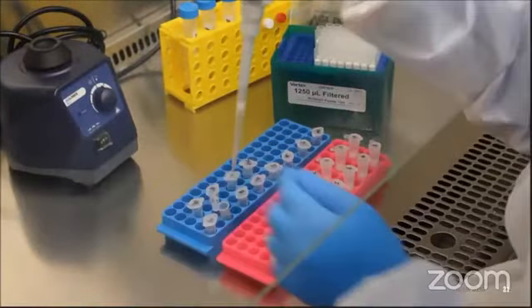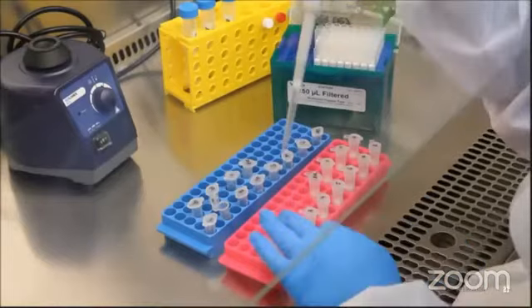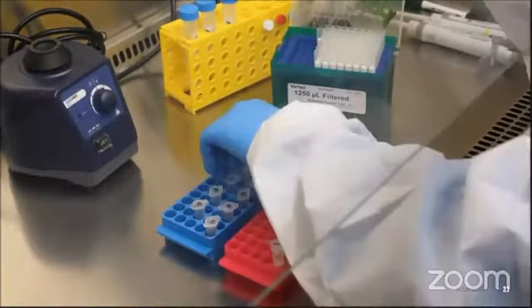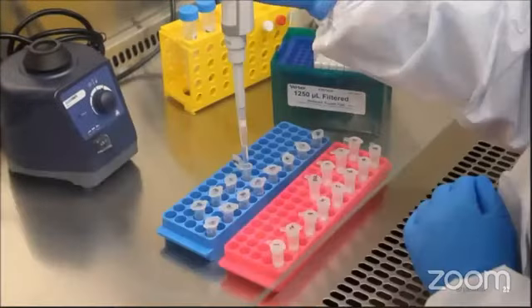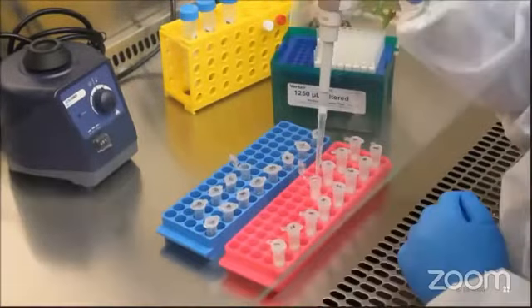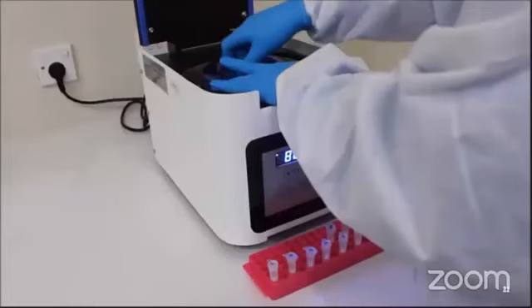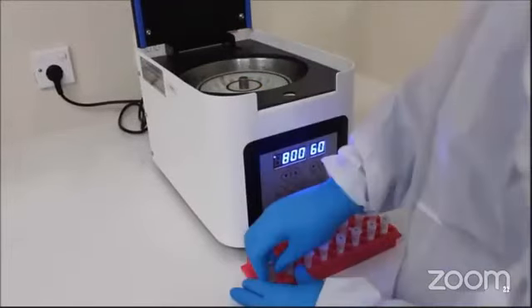Viral RNA binds specifically with the silica membrane of the column because of the negative charge. And contaminants are completely removed during the washing step. After addition of 630 microliter of the sample on the column, centrifuge the tubes at 8000 rpm for 1 minute.